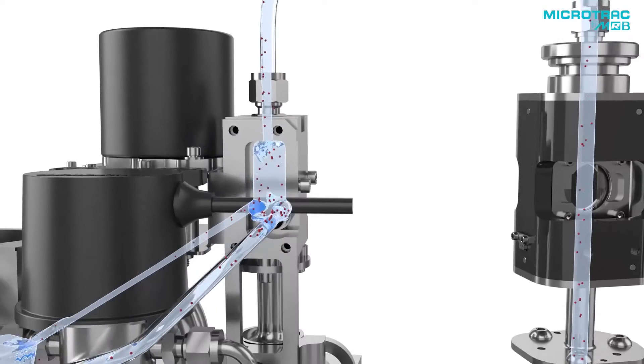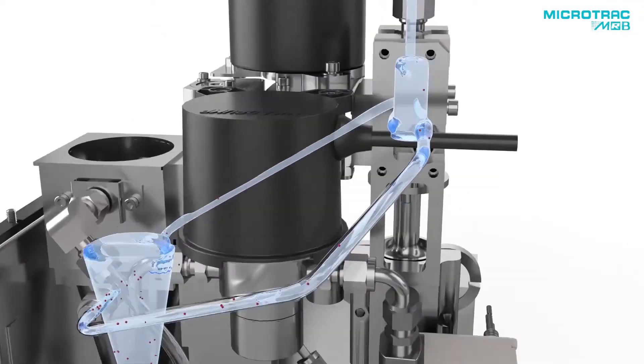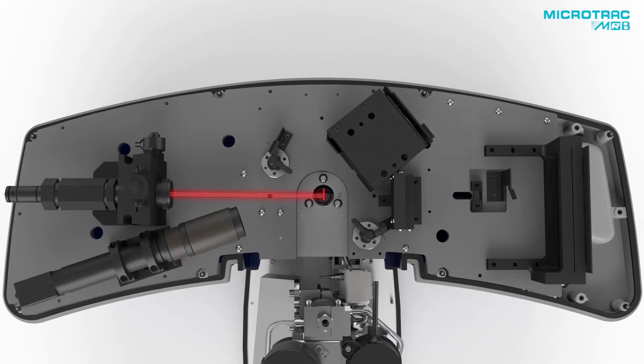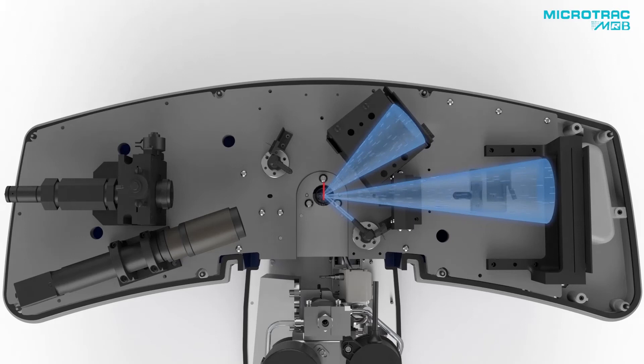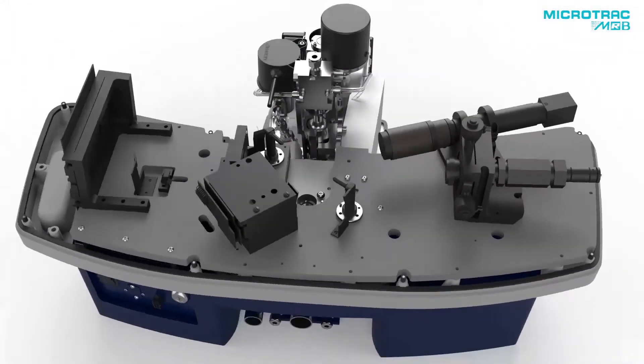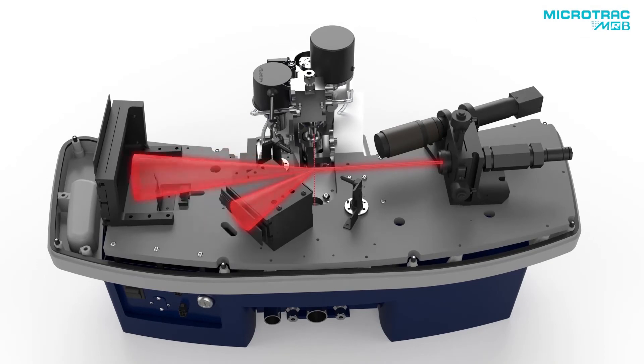As particles flow through the sample cell, they are interrogated by the laser diodes and the imaging system. Microtrack's patented tri-laser optical arrangement incorporates three diode lasers and two always-on detector arrays in fixed positions. The laser sequence captures scattered light across 165 degrees. Simultaneously, a separate LED light source illuminates the sample cell, while a high-speed digital camera takes live images of the sample.